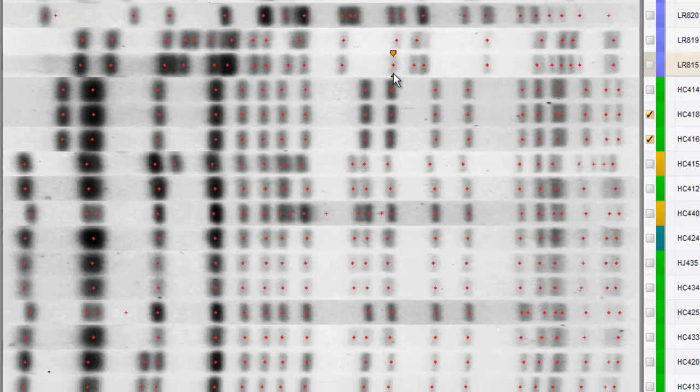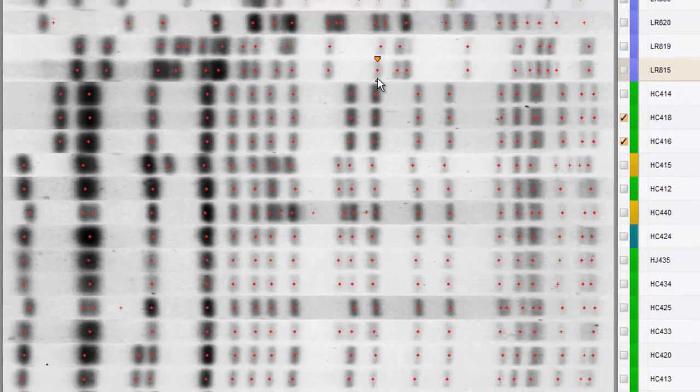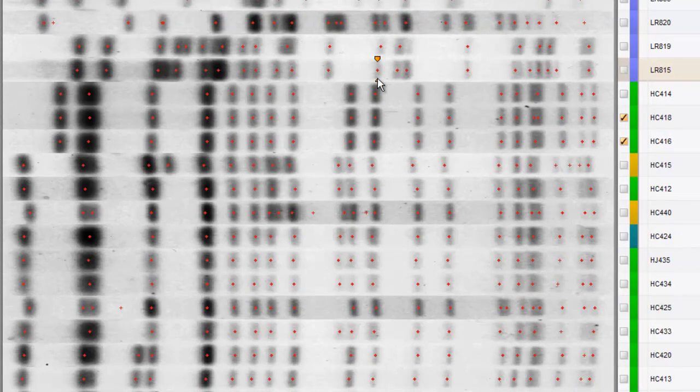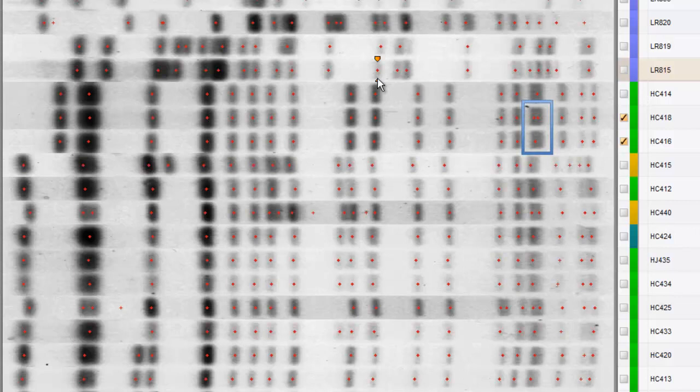Looking again at HC416 and HC418, I notice that towards the low molecular weight end of the patterns, there is a double band on HC418 and a single band on its neighbors. Clearly, there should be double bands on the neighbors as well.